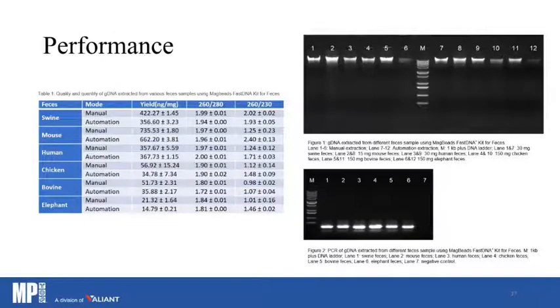We also want to check it on the gel. On the gel itself, we have the genomic DNA bands being intact, with no smearing, as you can see in the diagram. At the top right, again, the bands are displayed accordingly, and there is no smearing. For downstream processing, PCR of the genomic DNA, we see that all the bands were successfully displayed.